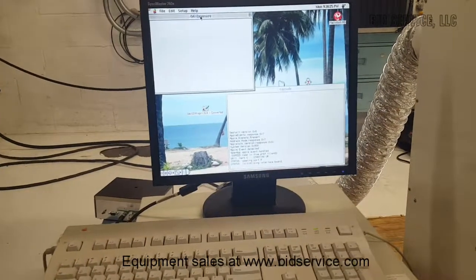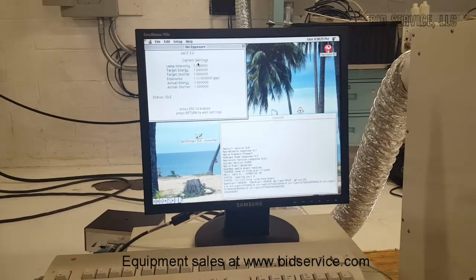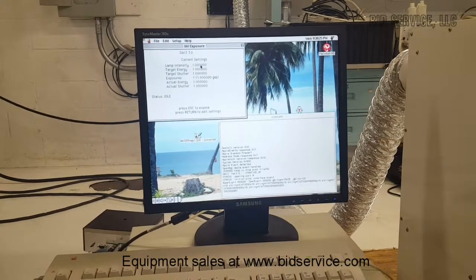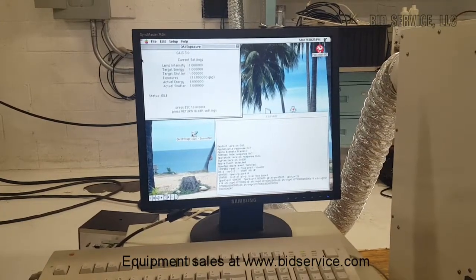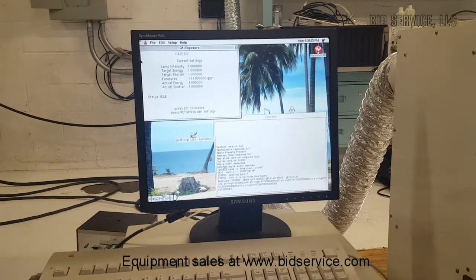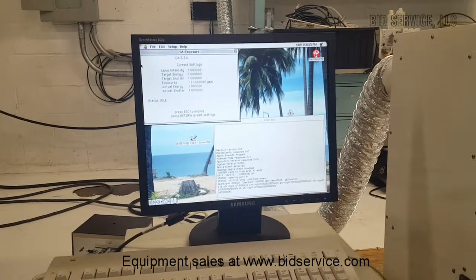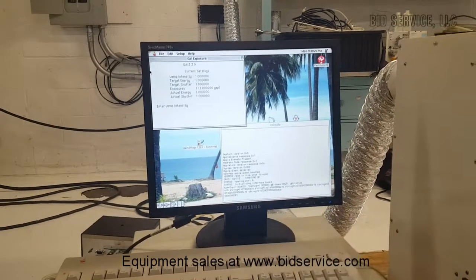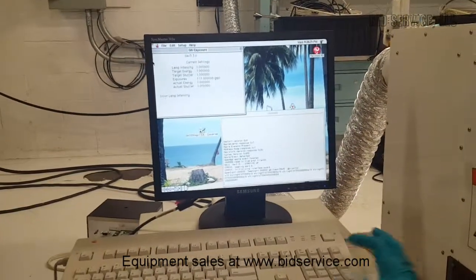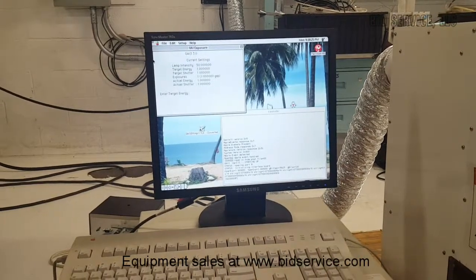The OAI exposure window indicates here lamp intensity. In order to enter the data here, you have to enter the lamp intensity, which is measured at the surface, at the exposure area. In this case, first press return, and now we have to enter the data, lamp intensity approximately 50 milliwatt per centimeter square.